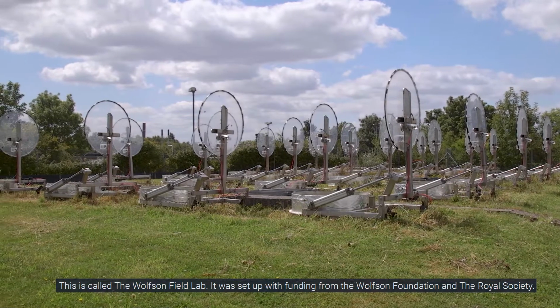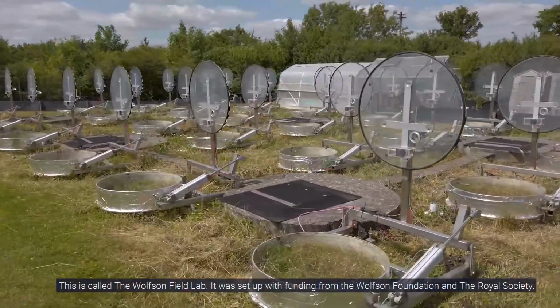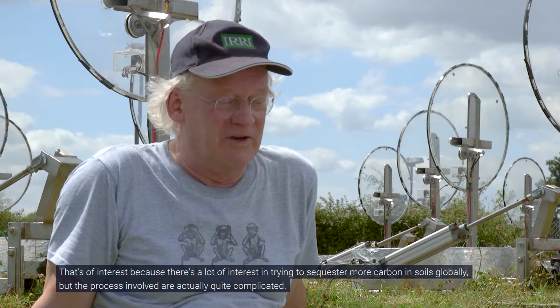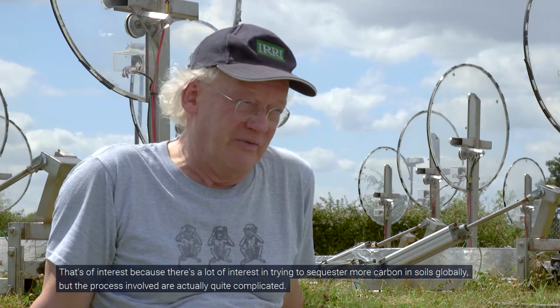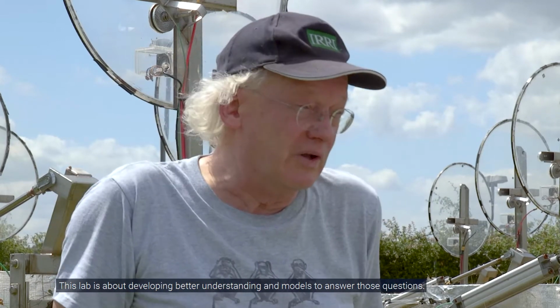Well, this is called the Wolfson Field Lab. It was set up with funding from the Wolfson Foundation and the Royal Society. It's about measuring greenhouse gas emissions from soils and particularly turnover of soil carbon. That's of interest because there's a lot of interest in trying to sequester more carbon in soils globally. But the processes involved are actually quite complicated. This lab is about developing better understanding and models to answer those sorts of questions.